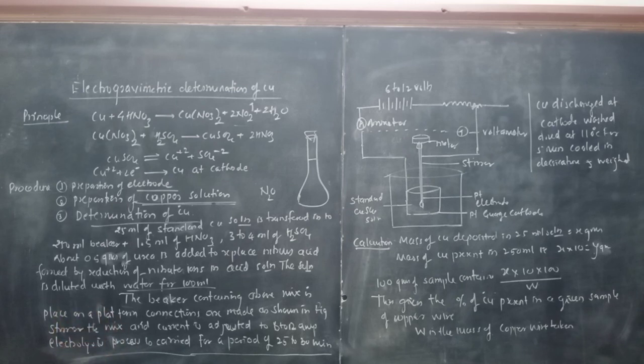Okay, this is the experimental procedure for the determination of copper by the electrogravimetric technique.